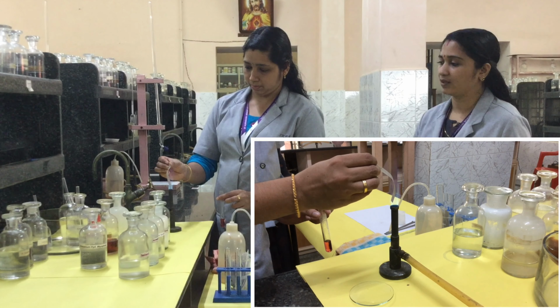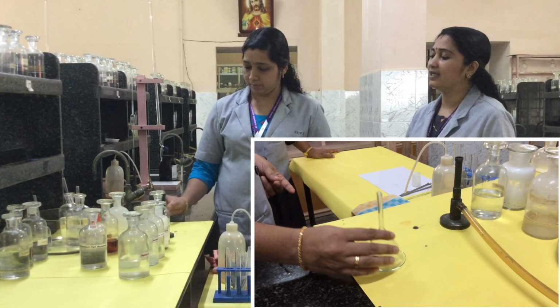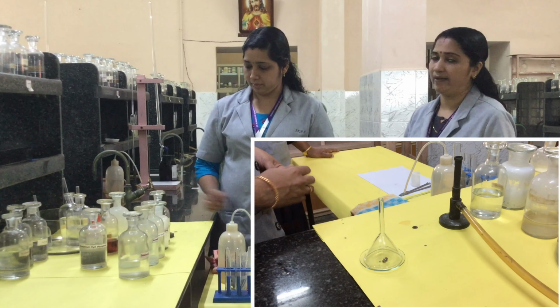We analyzed and got group 6 as the cation group. This group 6 contains magnesium. So we confirmed the presence of magnesium using the Magneson reagent test. Then the next test is the ash test. In the ash test we got pink ash, which confirms the presence of the magnesium cation. Then you have to keep this ash in a dry watch glass and cover it with a funnel for presentation.